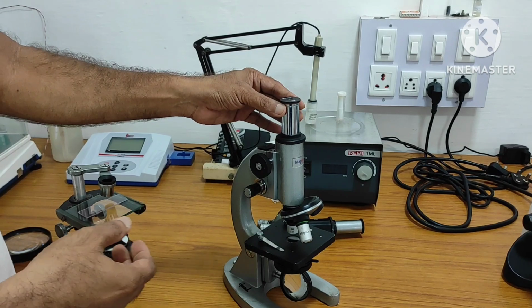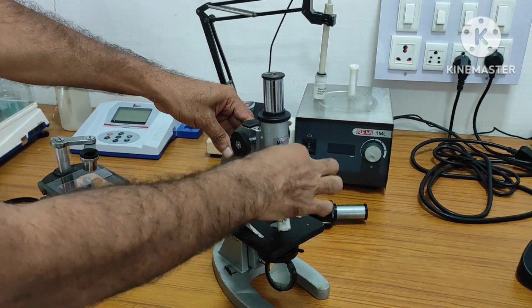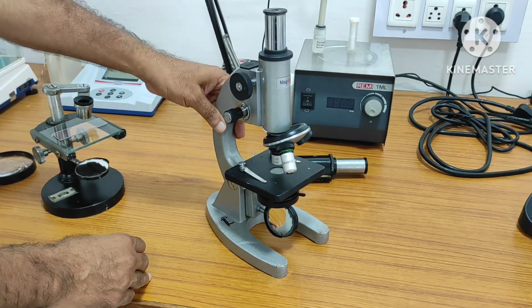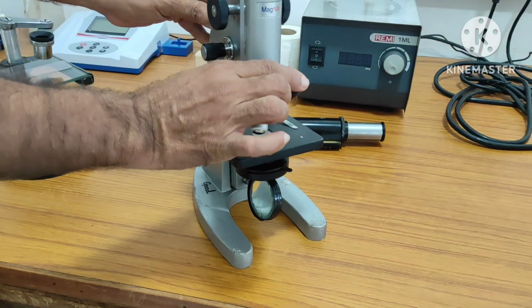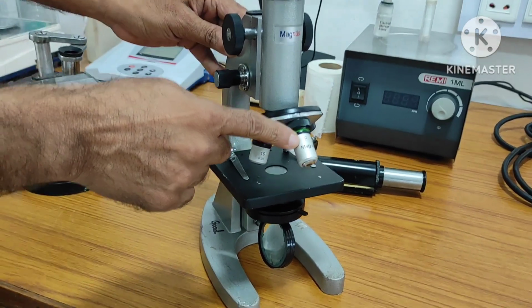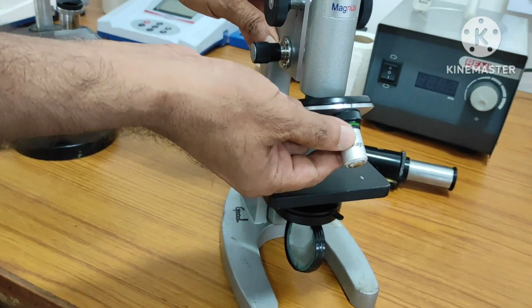It enhances the resolution and the power of magnification also, right? This is the tube, lens tube. This is the body where all these lenses and things are attached, and this is called as the nose of objectives. So these lenses are called as objective lens. This is eyepiece. Another lenses are attached with the objective lenses, right?